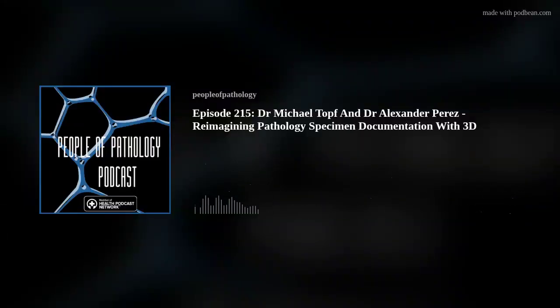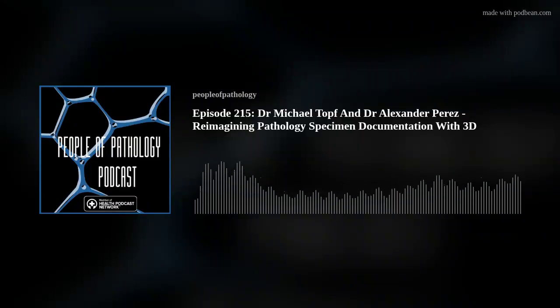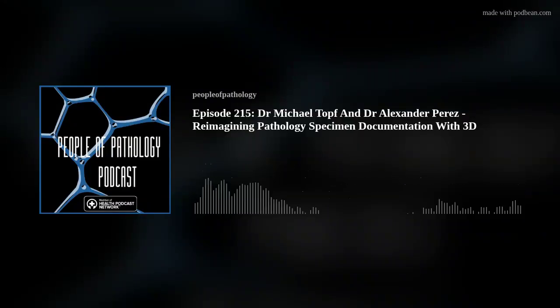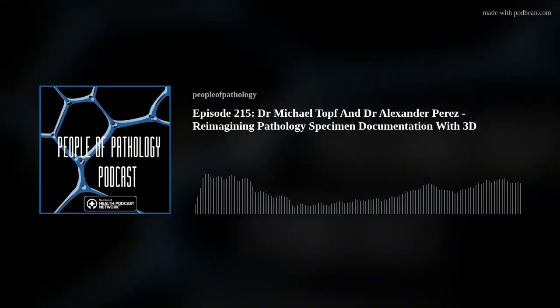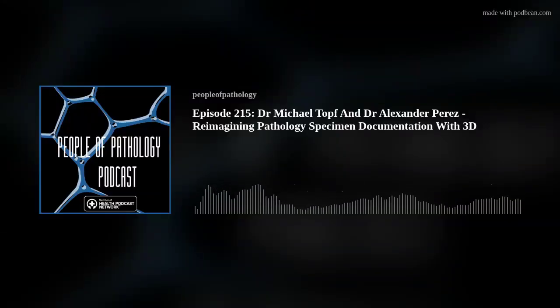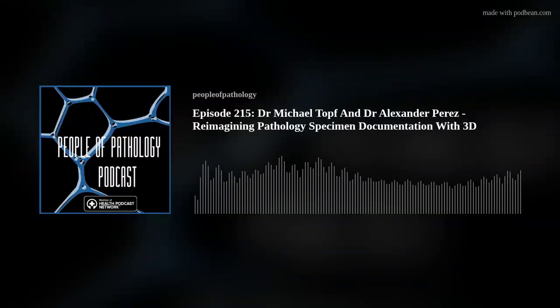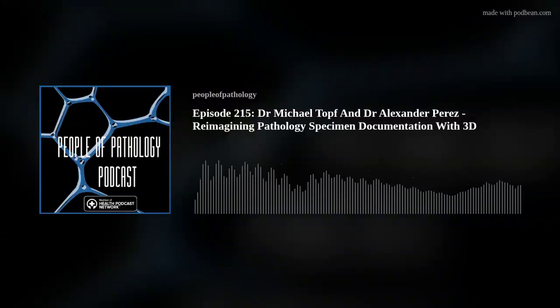We're actually uncovering them now that we create these models, and surgeons who are in the operating room and get to see the specimen in vivo and also reference radiologic imaging are able to clarify orientation for pathology assistants, for pathologists. But it's actually a very difficult problem to study, orientation and handoff errors, because a lot of times you just don't even know that they're existing.